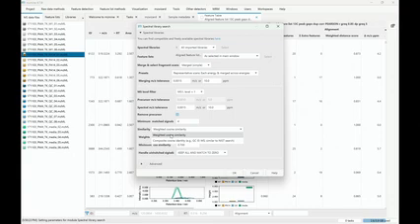Yeah, thanks a lot for the workshop. I wanted to ask if at some point of the wizard workflow you have implemented some dataset correction steps, like drift correction if we use big batches, or normalization, like PQN normalization, if we want to do more relevant statistical analysis.